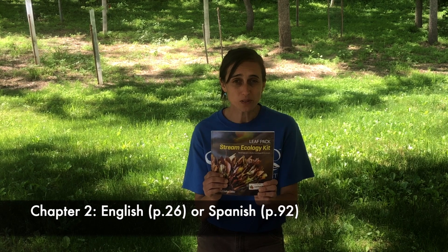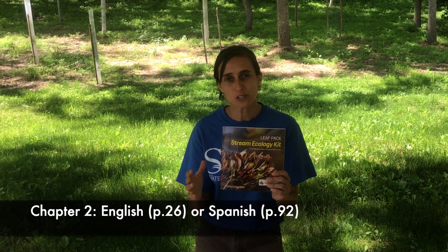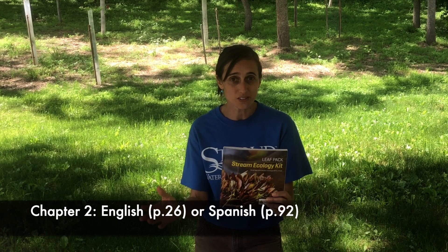Hey there, it's Tara Mintz with the Leaf Pack Network. In this video we're going to go over how to sort the leaf packs and then identify the macro invertebrates. Refer to chapter 2 in your manual — it has all the steps you need to follow plus a long list of supplies.